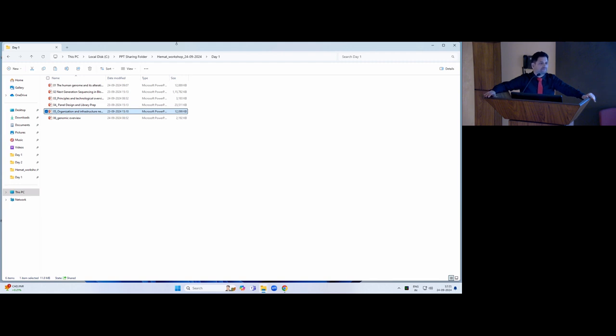And then fold 80 base penalty. Fold 80 base penalty? Oh, I am not familiar with that. Please educate me. So, in exome sequencing, when we look at Twist or Agilent, they say the fold 80 base penalty is close to around 1.2. Ideally, it should be around 1. If it is around 1.2 or 1.4 in the 6 GB or 8 GB of data, we are getting everything we want. But in the real-world situation, in our laboratory setup, we are always getting fold 80 base penalty above 1.6. We have tried 4 different exome kits, and all 4 give this.